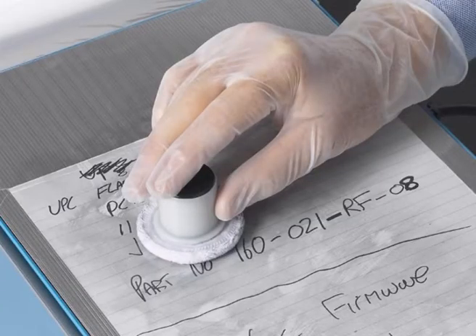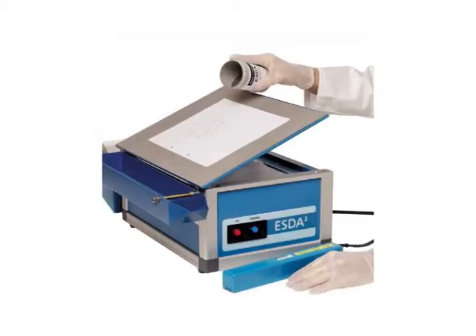Visualization and identification of indented writing provide great help in investigation. It is useful evidence for prosecution and a valuable assistance to the judiciary. ESDA is an accurate, sensitive and compact piece of equipment. It is a non-destructive technique which causes no damage to evidence.